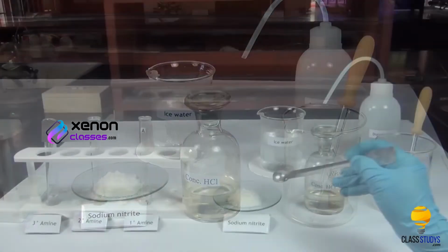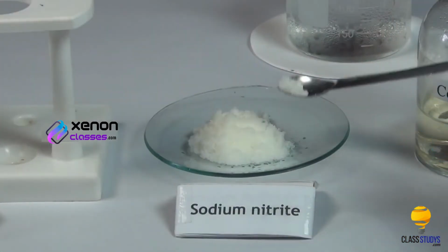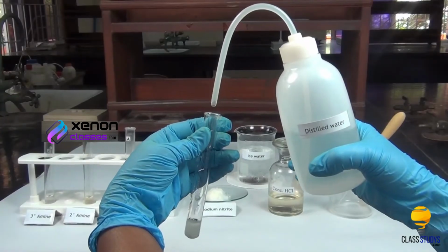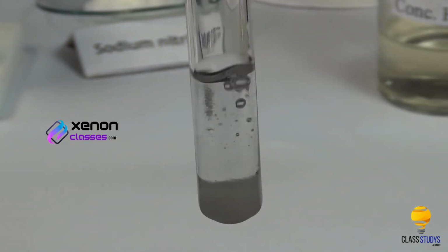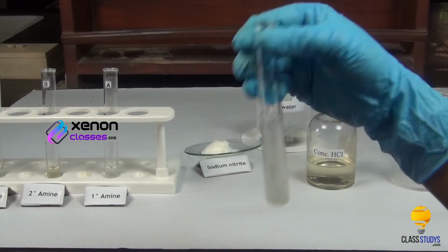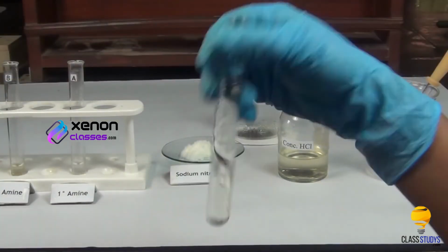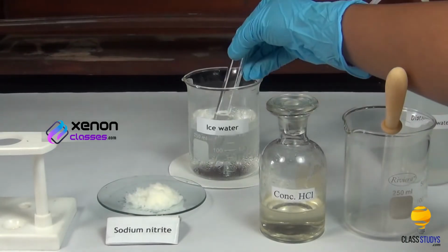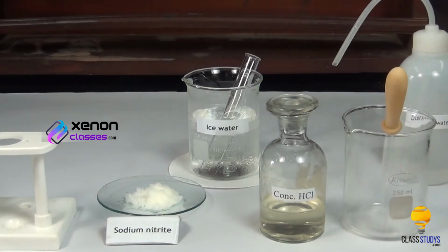Using a spatula, take a small quantity of sodium nitrite in a test tube. To this, add a small quantity of distilled water. Shake the test tube well to dissolve sodium nitrite in distilled water to get sodium nitrite solution. Cool the solution in ice-cold water for some time.